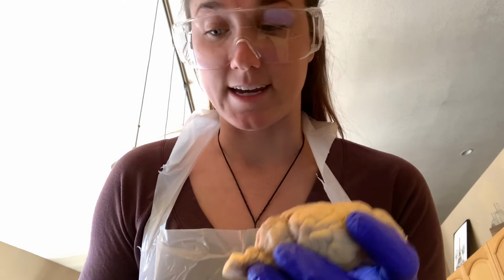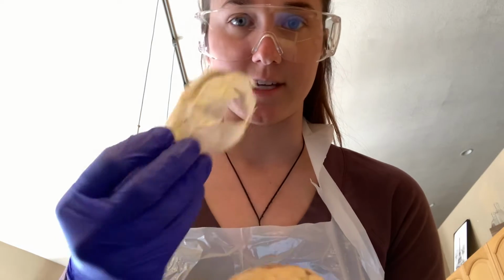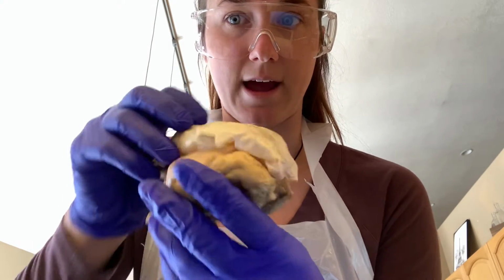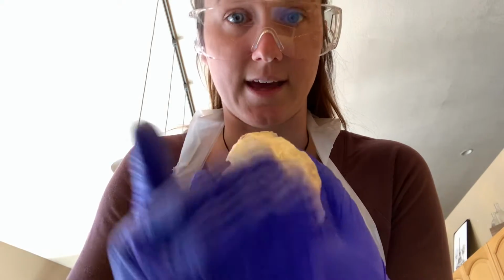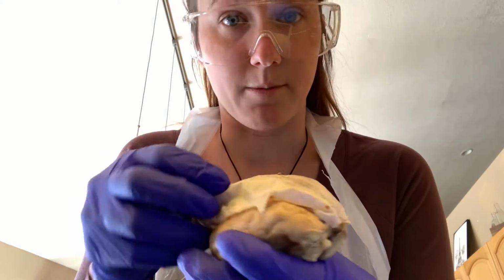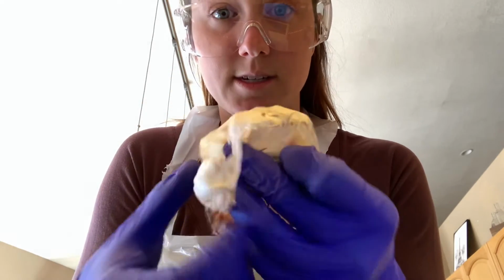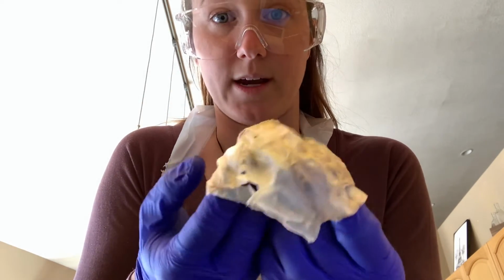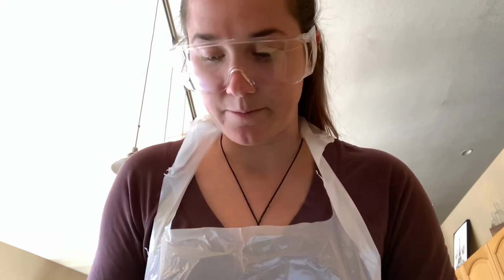The first thing I did in this dissection was I took off the meninges, and the meninges' purpose is to surround the sheep's brain and serve as a protective layer between the brain and the skull itself. The meninges also houses some blood vessels in the subarachnoid spaces to help supply the brain with the necessary nutrients it needs. So this is the meninges.